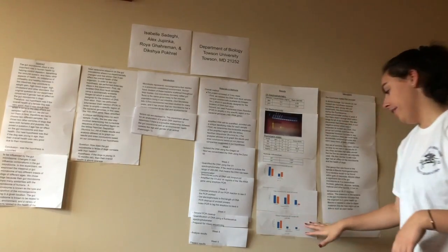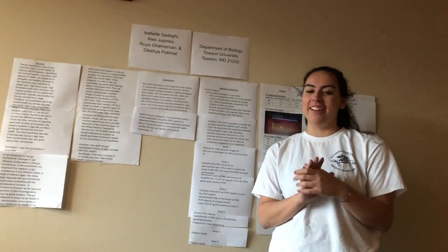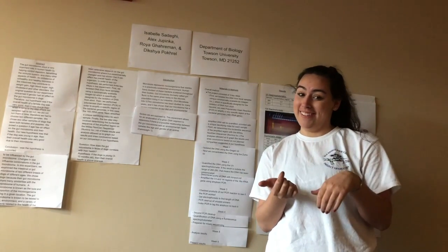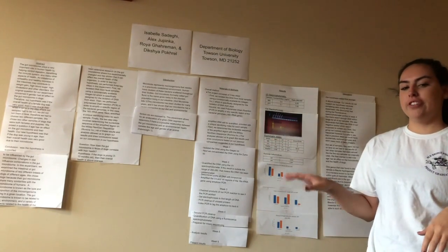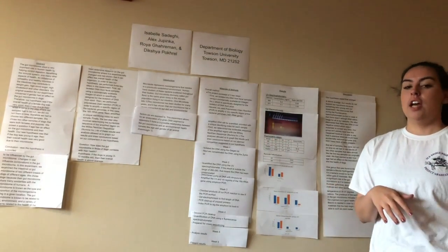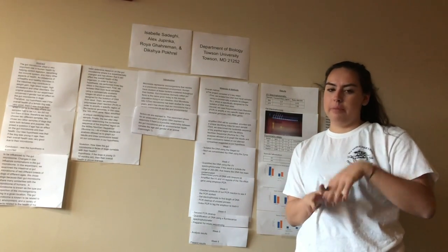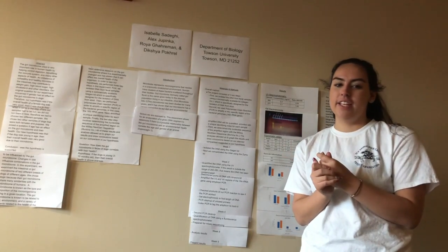For our genus graph, it showed the top 3 of 8 classifications, and Clostridiales, unclassified, and Bacteroidales are the classifications in the chart. Sample 343 had a higher percentage than sample 307, because it had a low percentage of those 2 bacteria.